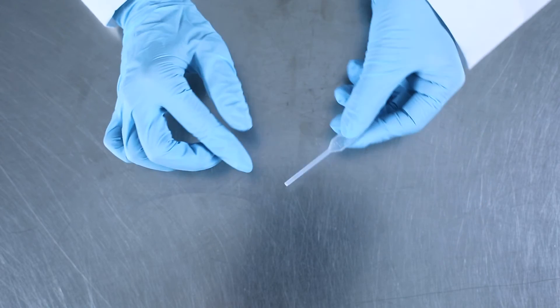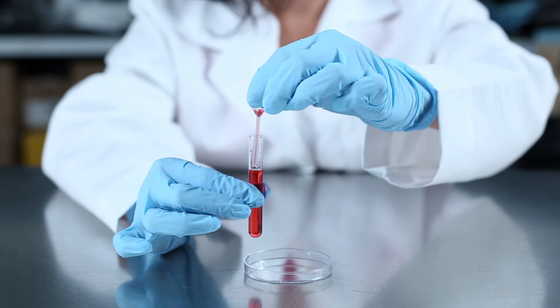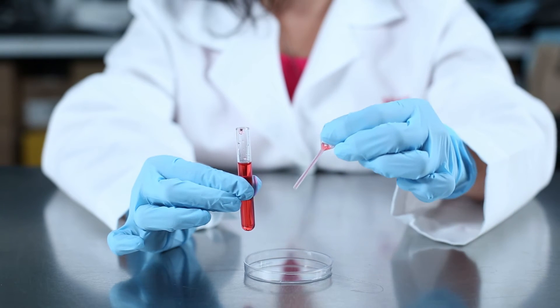We offer transfer pipettes with a narrow stem. Ideal for drawing and dispensing liquid to and from containers with narrow openings.